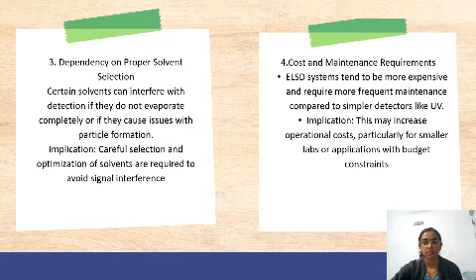Fourth is the cost and maintenance requirement. ELSD systems tend to be more expensive and require more frequent maintenance compared to simpler detectors like the UV detector. Implication: this may increase the operational cost, particularly for smaller labs or applications with budget constraints.